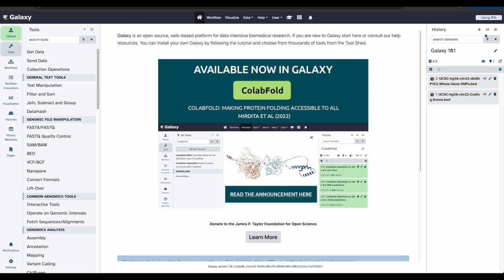Over here on the right side, under the history that we just made, you can see the data uploading. Once it's complete, it will turn green. When the data is ready, we want to rename the data set so that they are easy to find and recognize.